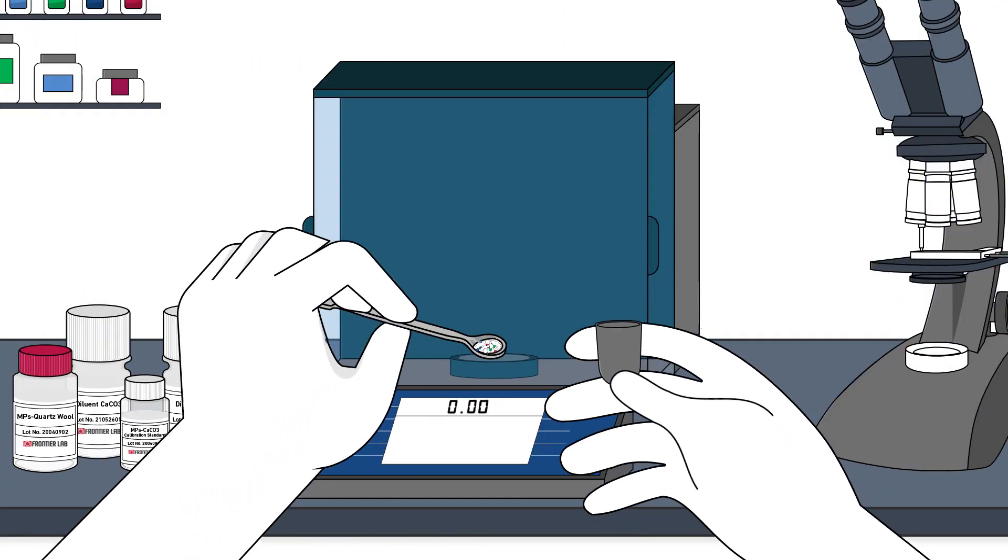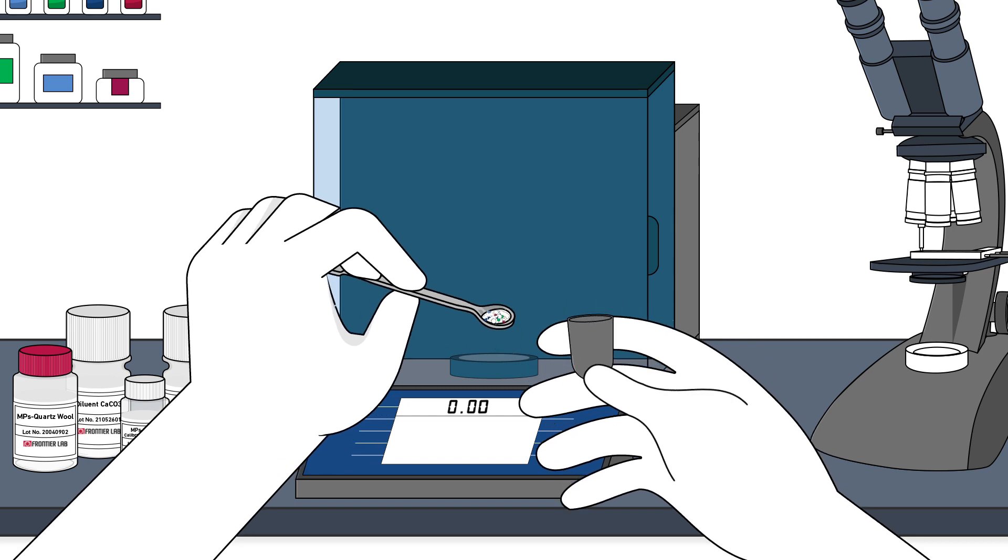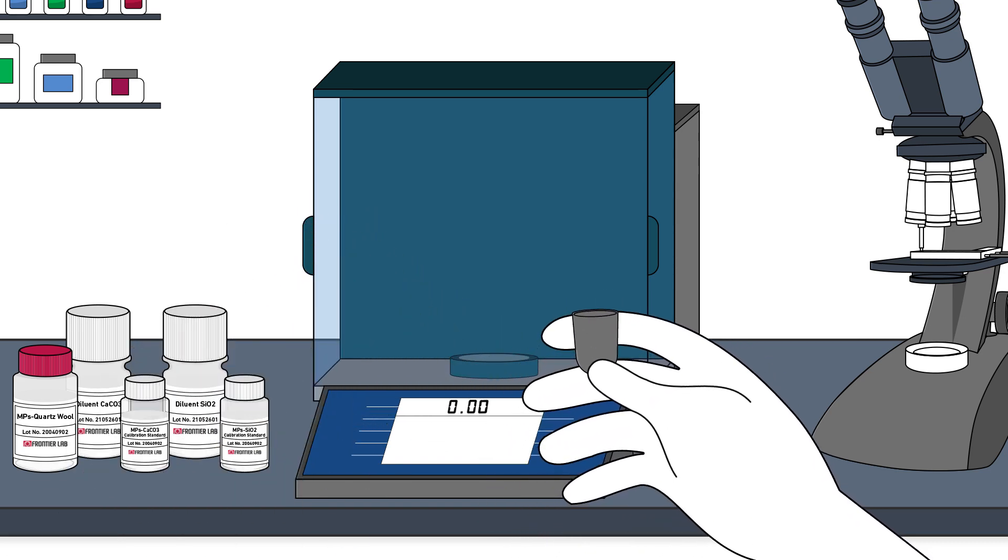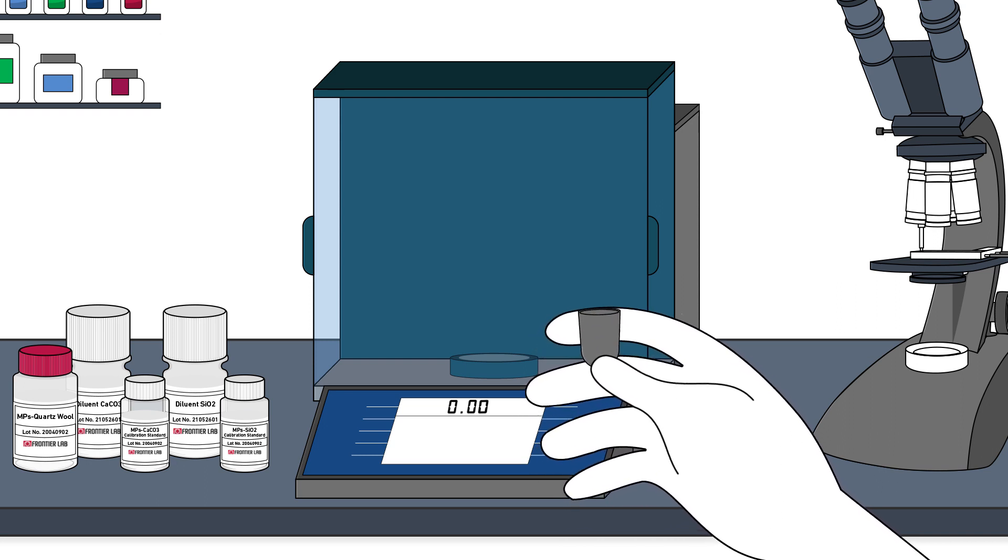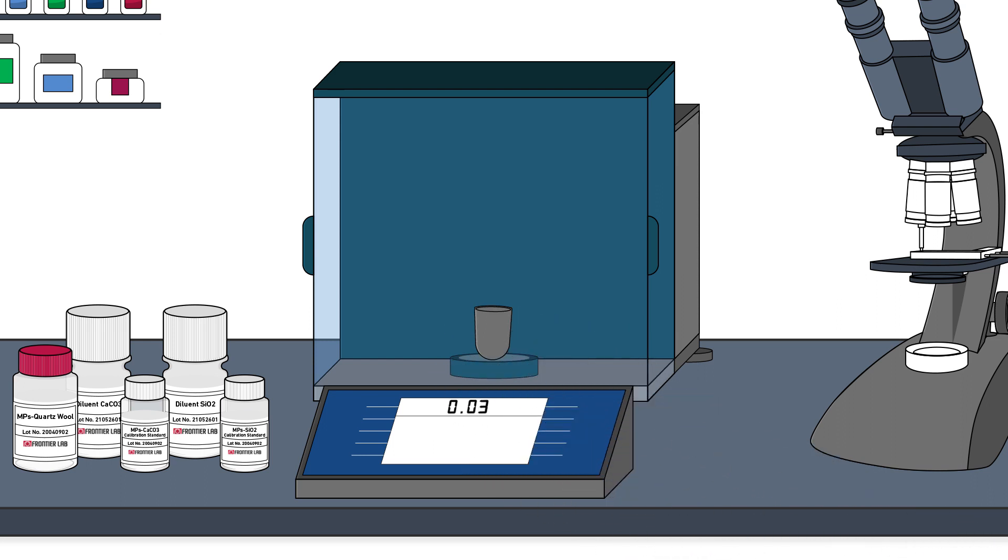So, how do you identify and quantify microplastics using Frontier's configuration? First, simply place micrograms of the calibration standard and your unknown sample, mixed with the diluent powders if using a semi-microbalance, into inert sample cups. Measure the weights, put them into the AutoShot sampler, and start your Microfurnace Pyrolysis GC-MS run.